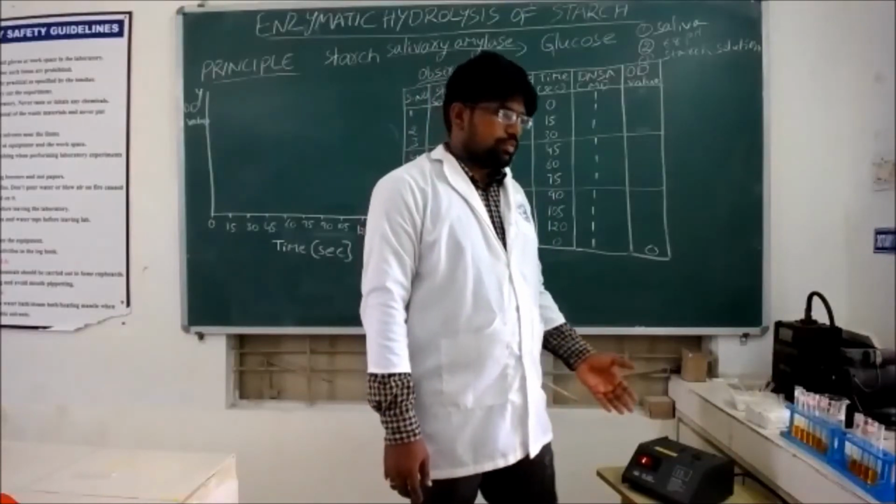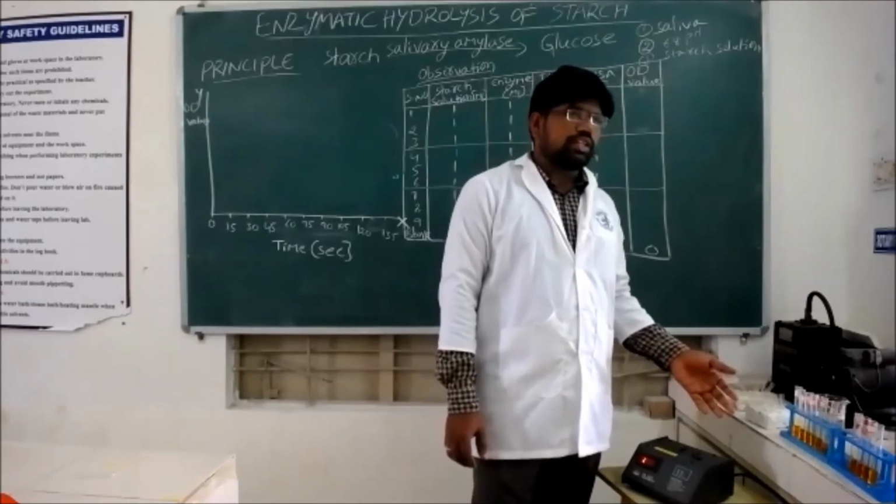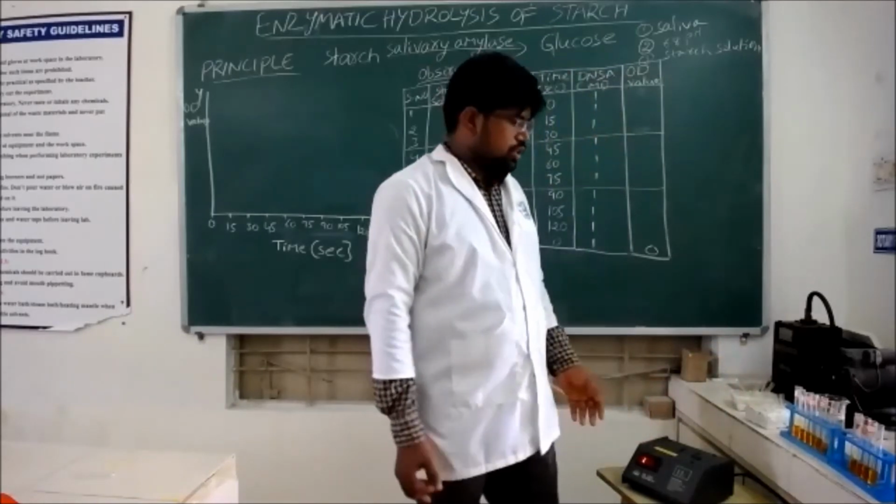After boiling, cool the mixtures and measure the absorbances using the colorimeter at 540 nanometers.